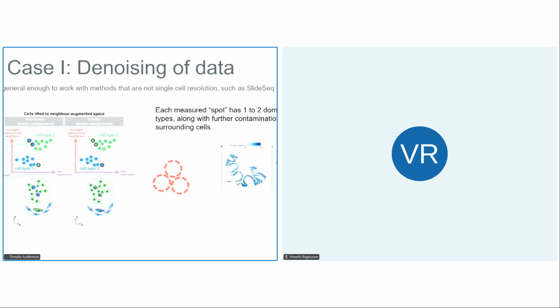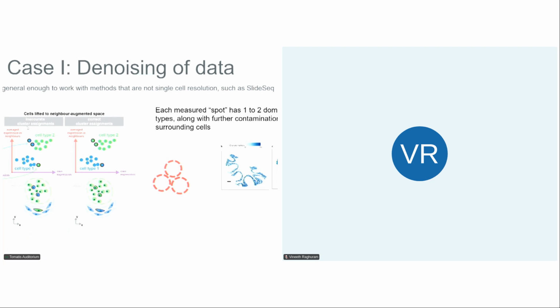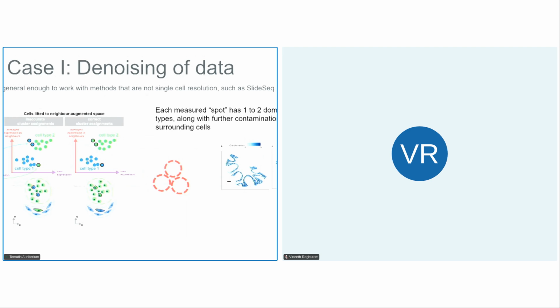and normally a cell typing method would label these cells as blue cells and these cells as green cells if all it's looking at is the transcriptome, and it would do so rightly because these cells are within the blue region. But we posit that if cells have characteristic neighborhoods, then you can use that neighborhood information to help disambiguate cells that are near decision boundaries.